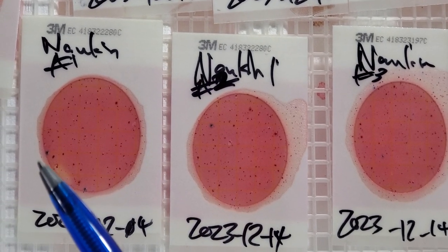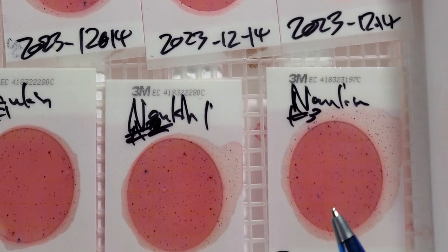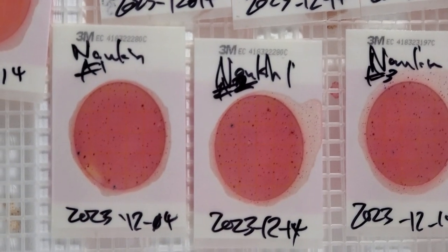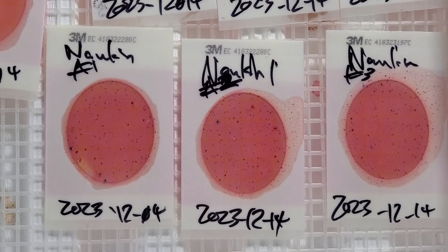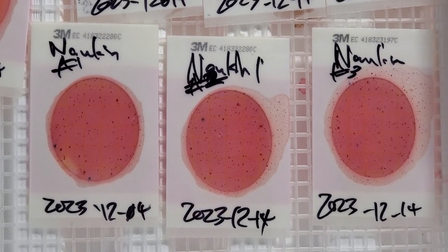For Nanken, we got one, two, one, and one — so that adds up to four, which ends up being 133 CFU. These are all well within the acceptable range. It'd be nice for it to be lower, but I wouldn't worry about these numbers.